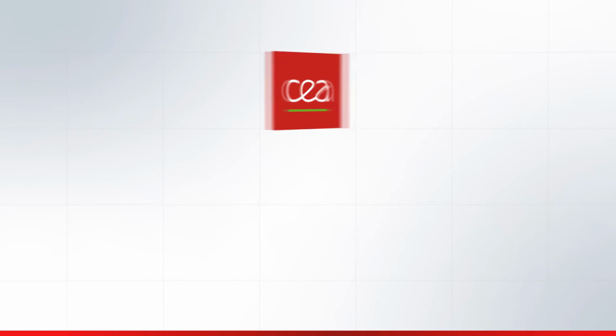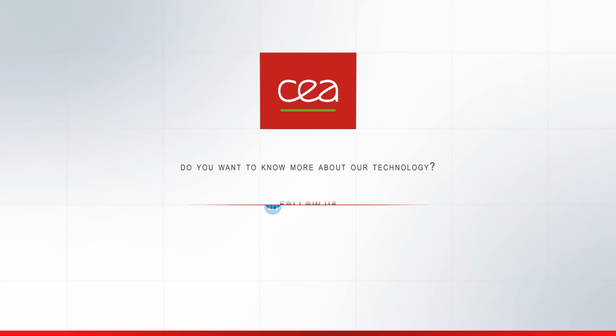So when do you see this going into production? Are you going to license it, or how does that work? So at the moment there is already a commercial product for bioproduction application with our French partner Iprasens, and for point-of-care analysis, for example meningitis applications, it is something that, I hope, will become a commercial product very soon.